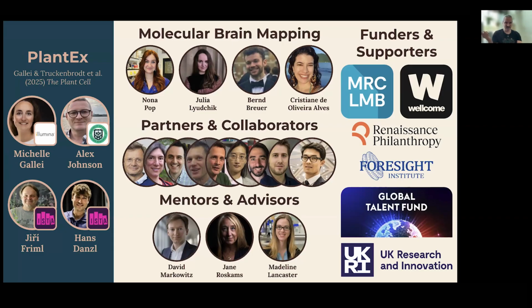You would get the same resolution just from a conventional microscope. And potentially you could go even higher. But the only thing is that we have not done it because my group focuses more on neurobiology. But anyone who wants to try it out, I would be happy to lend some expertise. I'm sure it would work.